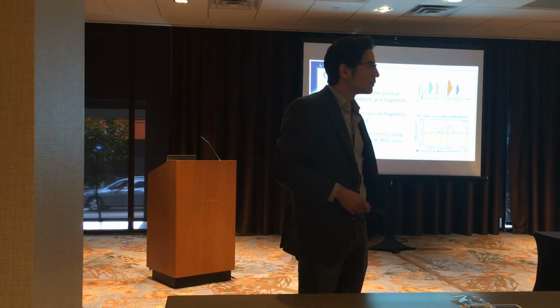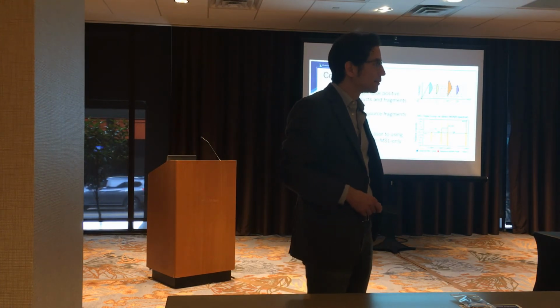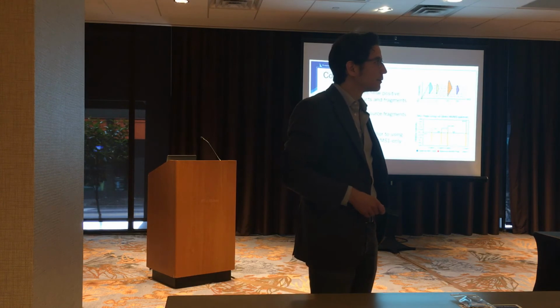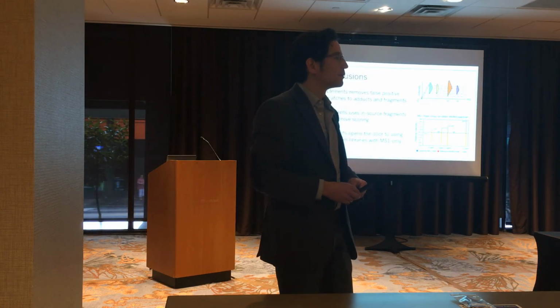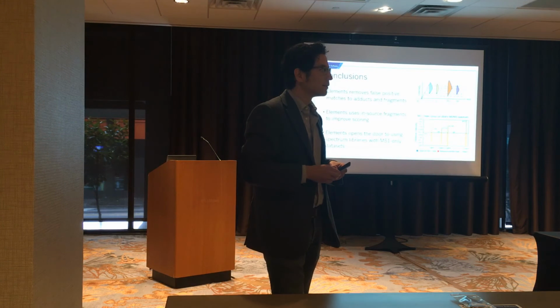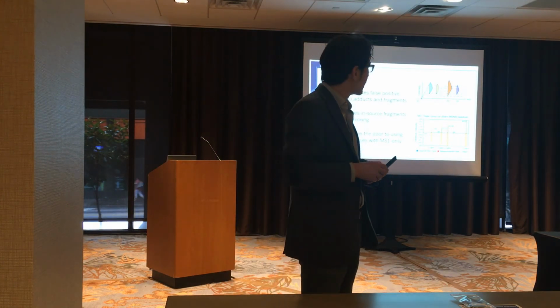And I would change the settings a little bit so that we didn't get so much. Mm-hmm. But I always wondered, because what you end up with is a lot of extra. And if you search with a no enzyme specification, you often can get that assigned piece. But yeah, so you can definitely see a lot of these.